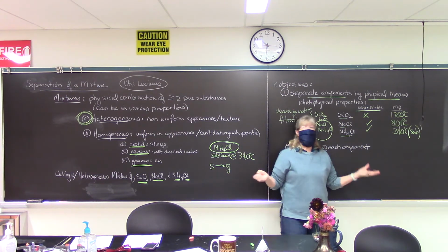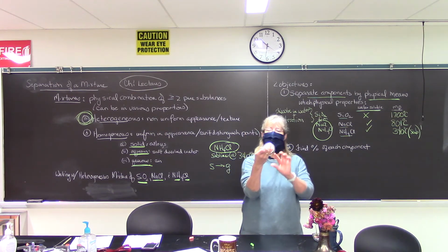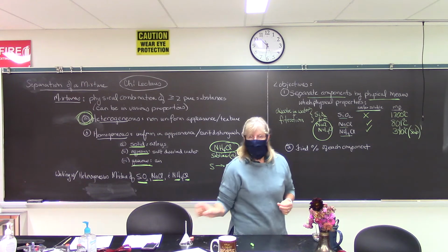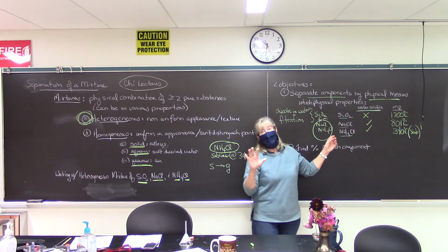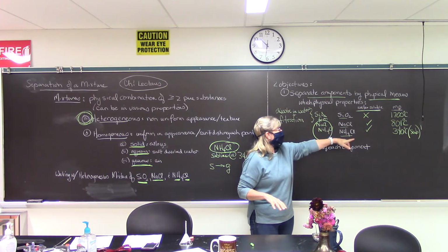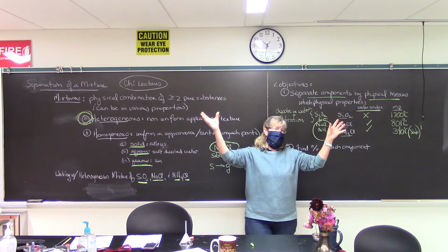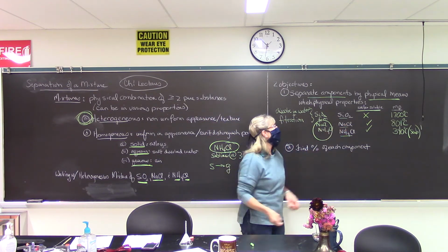Why not? Stick it over a Bunsen burner, see if you can catch some of the ammonium chloride so we don't have it all going into the atmosphere, you know, wiping out birds that are flying overhead. That really wouldn't happen. But anyway, let's get rid of the ammonium chloride. Poof, it's gone, okay? It actually takes a while for it to poof, but it'll be gone.